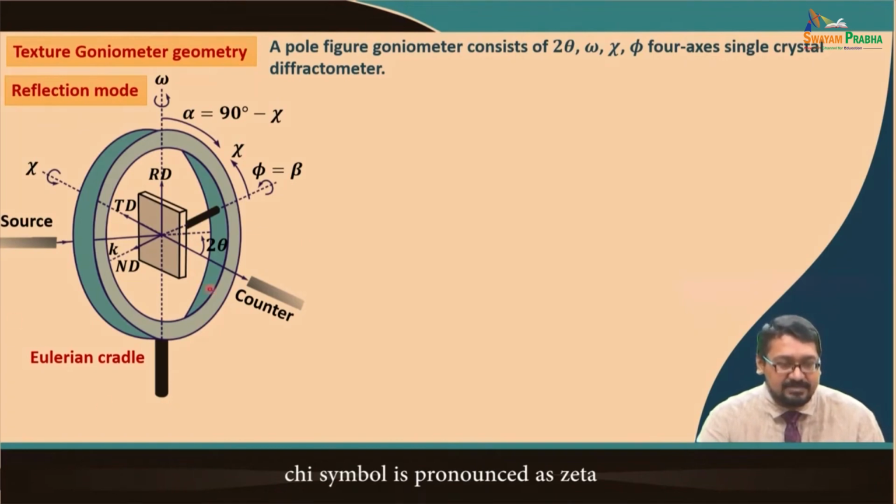This goniometer is in most cases used in reflection mode, because the X-rays generally produced in laboratories are not so intense, do not have a short wavelength lambda, and are not hard enough to penetrate even the thinnest specimen to obtain a diffraction pattern in transmission mode. But yes, neutron diffraction or even synchrotron diffraction can be used to get transmission mode of this kind of diffraction experiment.